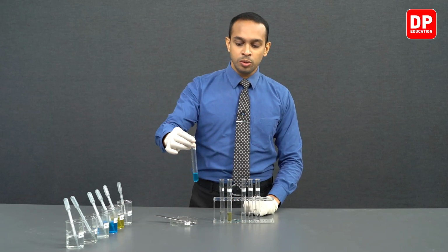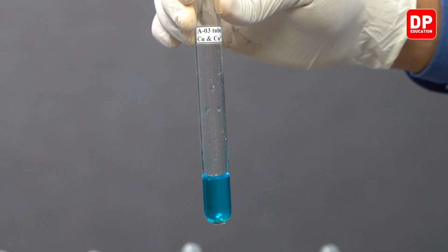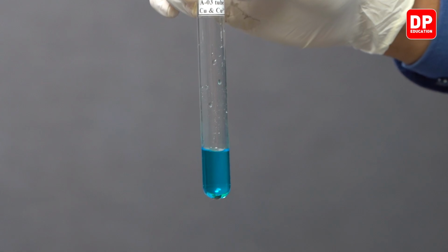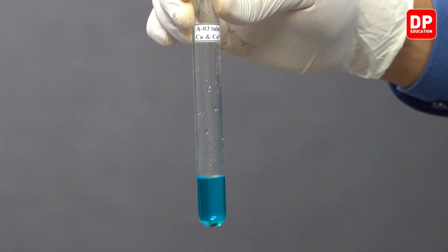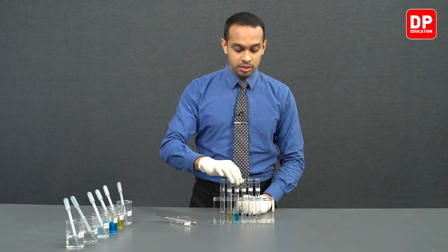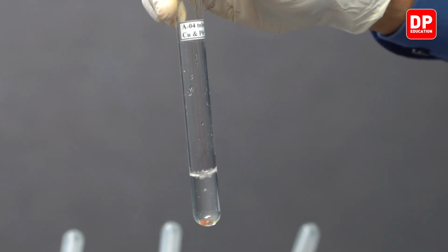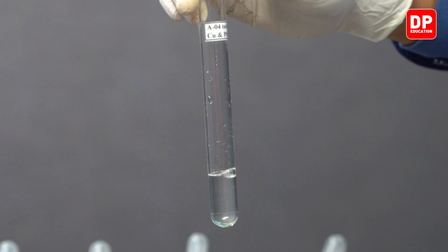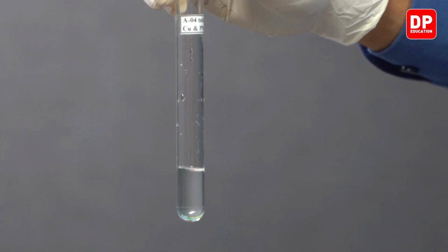When it comes to copper 2+ ions mixed with copper metal, you can see no precipitate, just the copper pieces at the bottom of the test tube. There is no precipitate or any other observation that you can see over here. When it comes to copper and lead 2+ ion solution, you do not observe a precipitate being formed, just the copper metal pieces at the bottom of the test tube.